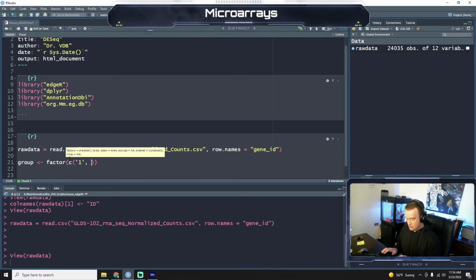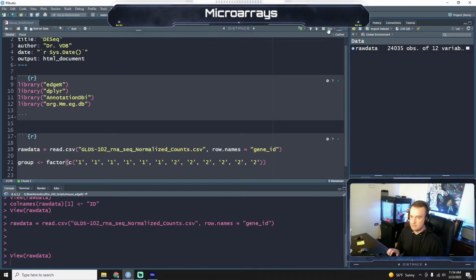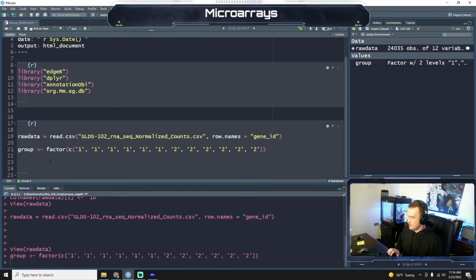So I'm just going to do 1, 1, 1, 1, 1, 1, and then 2, 2, 2, 2, 2, 2. So 6 1s and then 6 2s. So you're in group 1 or you're in group 2, flight or ground. All right, so we have our group.